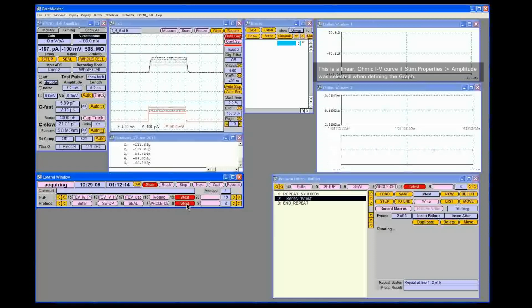And actually what I'll do is I will try to flip through the model cell here to try to get some additional data points stored in here.